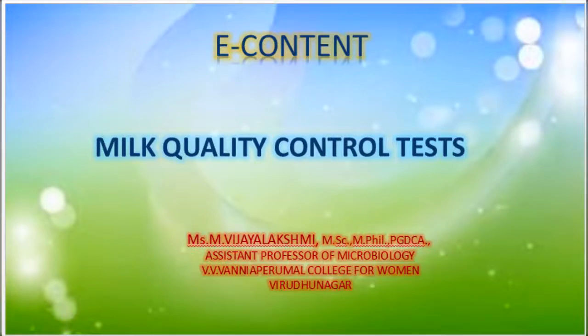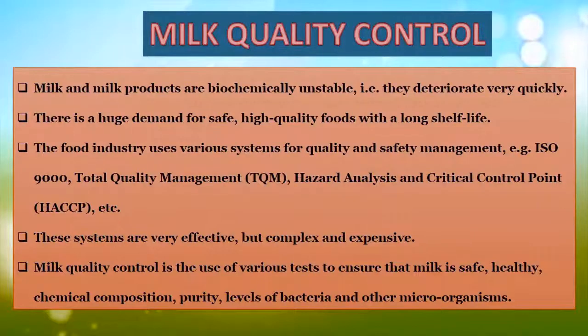Good morning. Today's topic is about milk quality determination by MBRT technique. MBRT means methylene blue dye reduction test. So I am Vijayalakshmi from the Department of Microbiology. Let's go to the topic. First slide is about the quality.